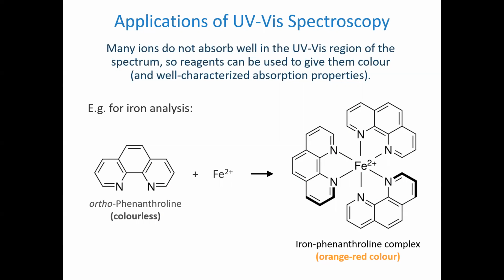So indicators are not just pH things. There's indicators that will bind with calcium, as we saw in lab 1, and this is an indicator that binds with iron 2 specifically, orthophenanthroline, I guess.